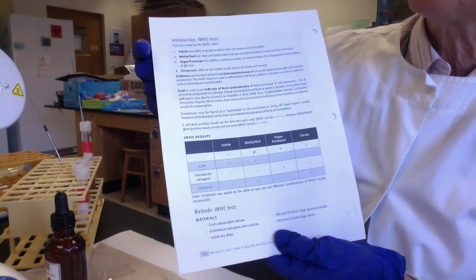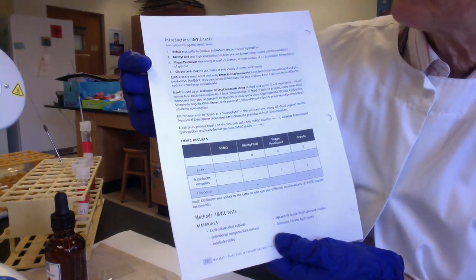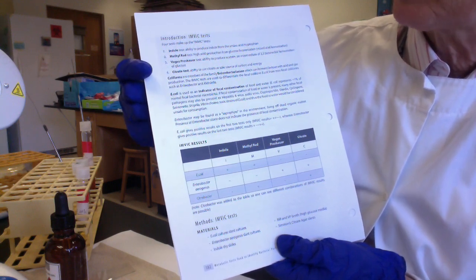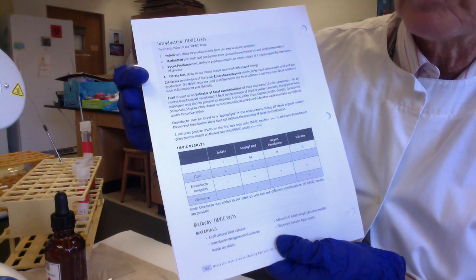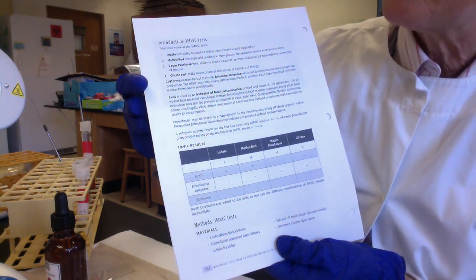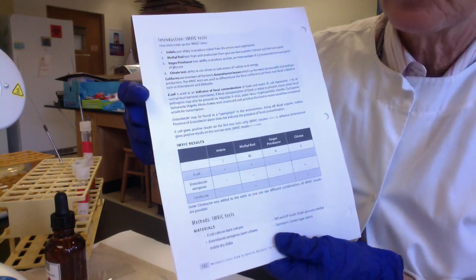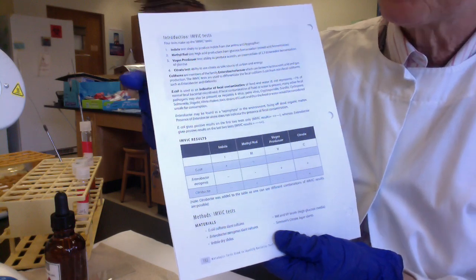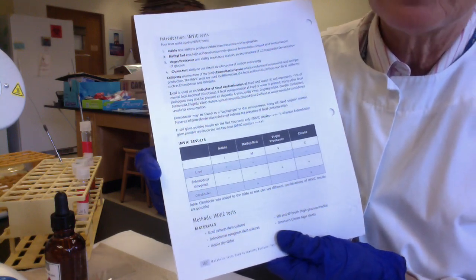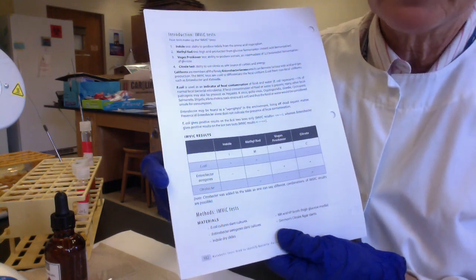The indole test to determine if a microbe makes tryptophanase, the methyl red test, which determines if a microbe carries out mixed acid fermentation, the Voges-Proskauer test, which determines if the microbe carries out 2,3-butanediol or butylene glycol fermentation, and then the citrate test is to see if the microbes can use citrate as their sole source of carbon and energy. So the 4 tests are often run together to help distinguish E. coli, which is an indicator of fecal contamination, from its close cousin Enterobacter aerogenes.